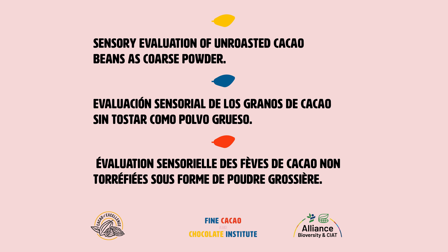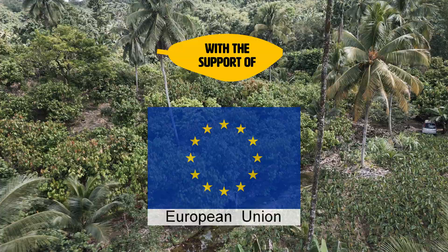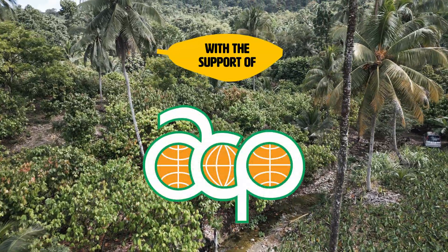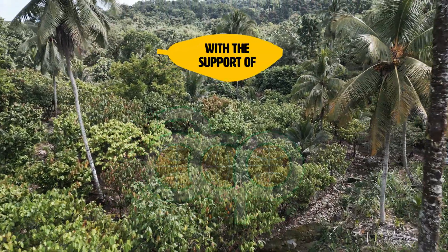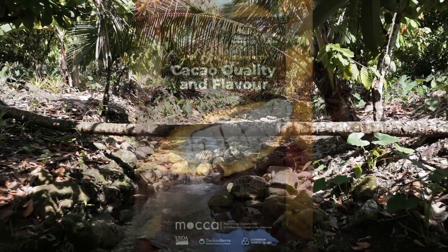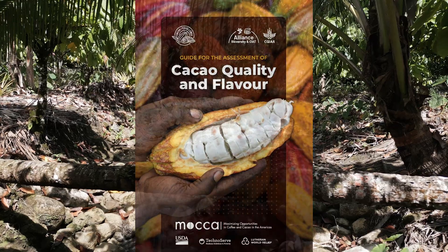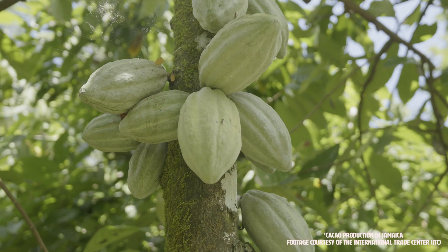Hello! Thank you for your interest in the Fine Cacao and Chocolate Institute's contribution to the development of global cacao evaluation protocols. This video demonstrates the procedure for preparing and conducting sensory evaluation of unroasted cacao beans ground into a coarse powder, as outlined in Chapter 17 of the Guide for the Assessment of Cacao Quality and Flavor.